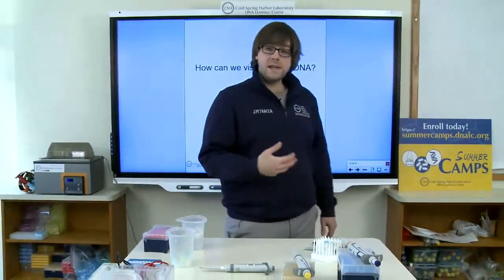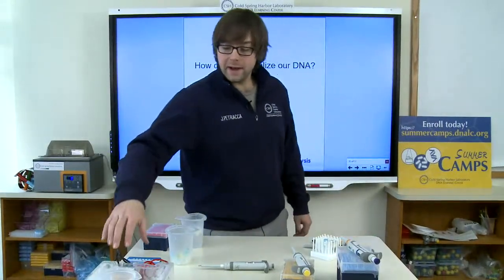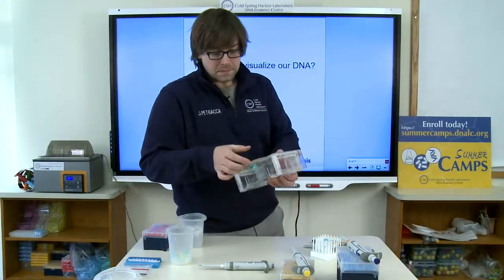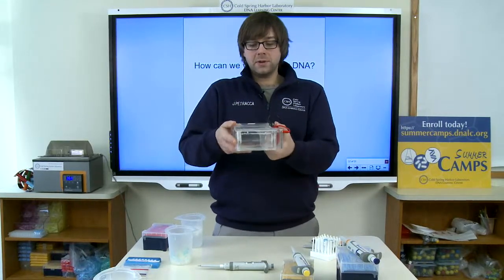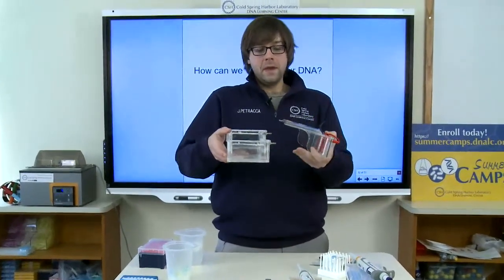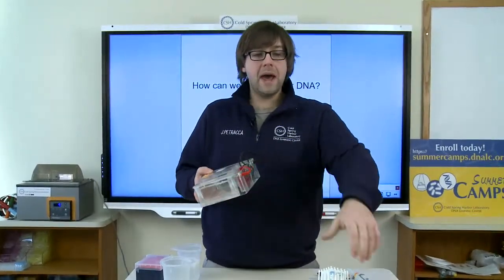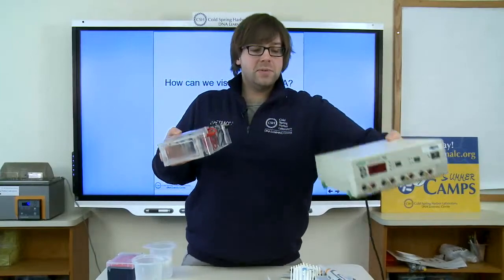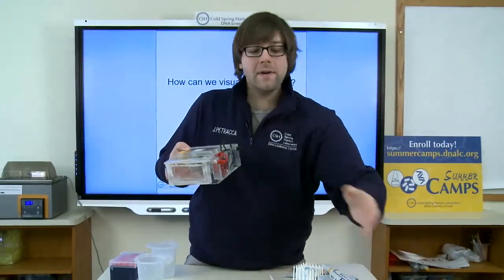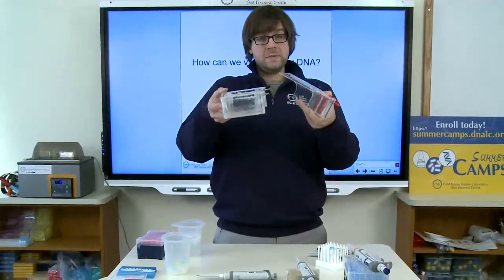It was actually invented here at Cold Spring Harbor Laboratories. Gel electrophoresis uses one of these little chambers called a gel electrophoresis chamber, and we hook this into a power supply. The power supply is right here, and this power supply is going to generate an electric field in this box here.